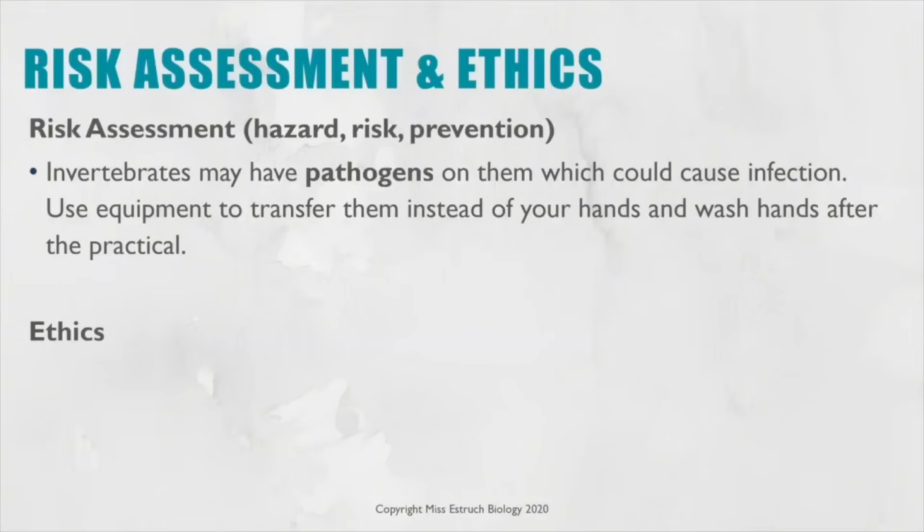So risk assessment and ethics, the key risk assessment is the fact that we're working with invertebrates. They may have pathogens on them that could cause infection. So that is one of the reasons why we're using the teaspoon to transfer them rather than just picking them up with your hands. And you do need to make sure you wash your hands after the practical.